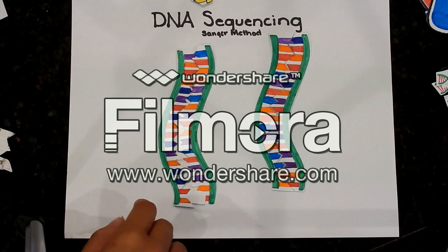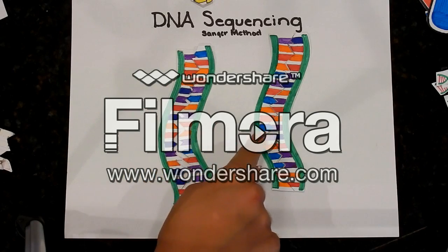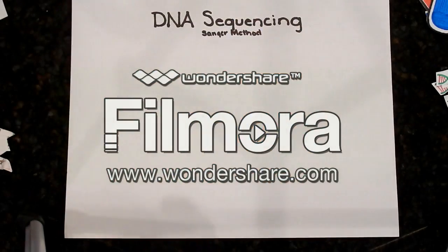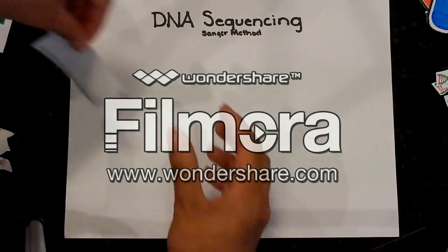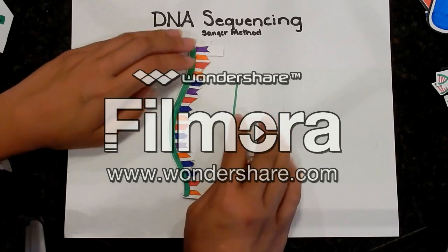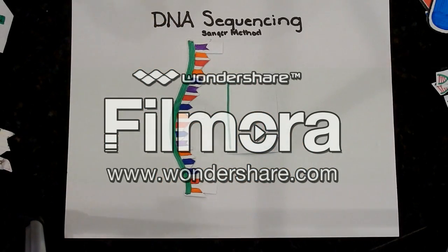When extending the DNA strand, it will produce a new strand like normal by adding complementary nucleotides, as I showed. However, the chain will terminate at different lengths whenever a dideoxynucleotide is added. So, if we were to draw this out, say this green line represented one of the strands of the DNA copy.